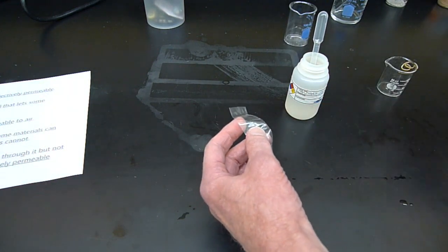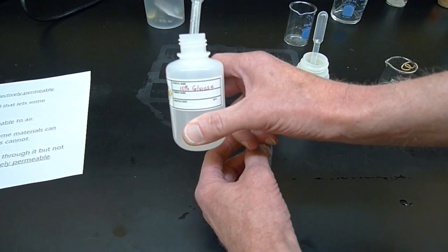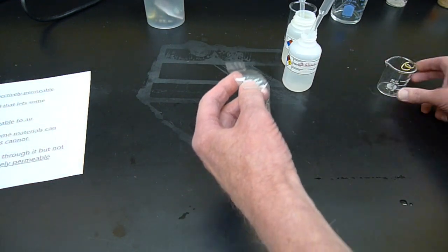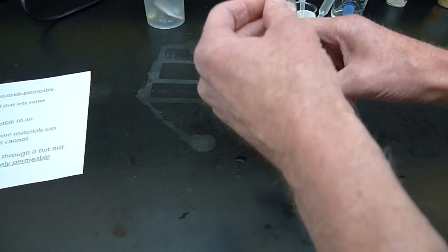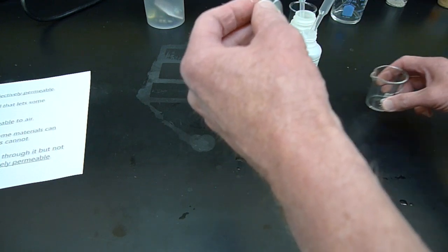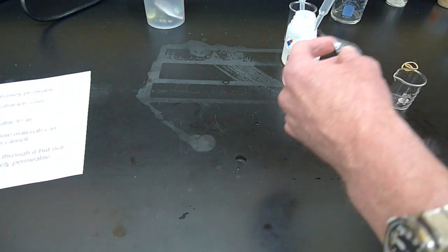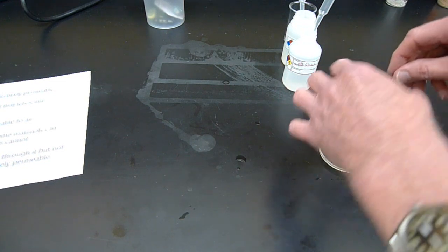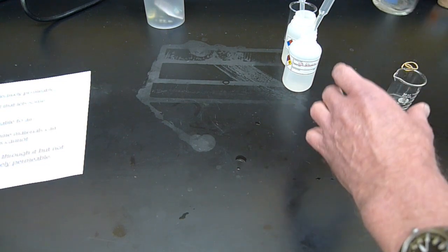I'm also going to have some glucose, a relatively concentrated solution of the sugar, that's going into the bag too. The dialysis bag will go into a beaker with some water. Then we're going to analyze whether or not the glucose passed through, whether or not the starch passed through, or what exactly is going on in here.